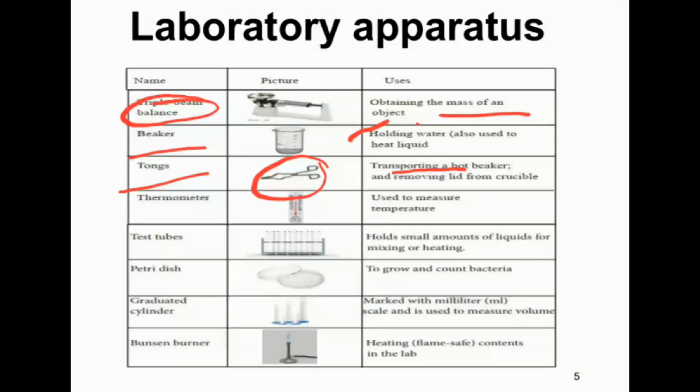I'm sure you all are familiar with this. And thermometer is used to measure temperature.